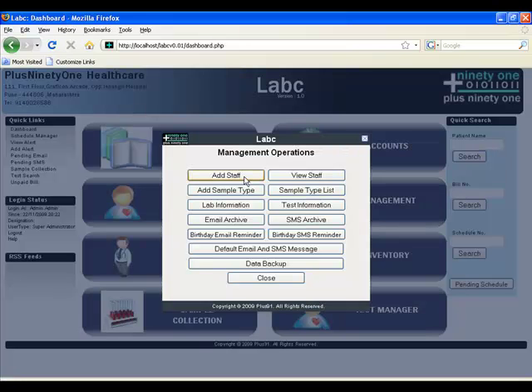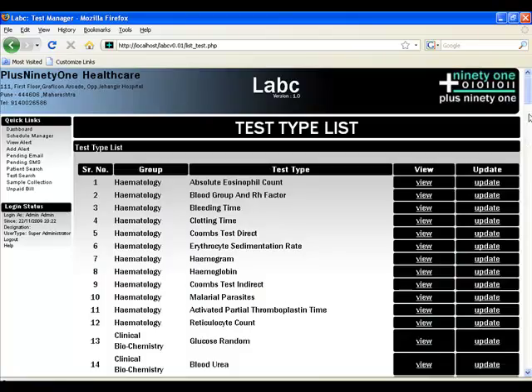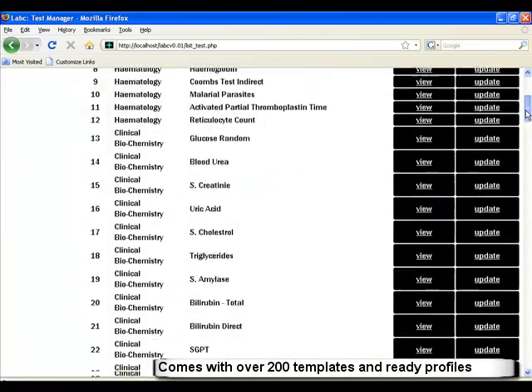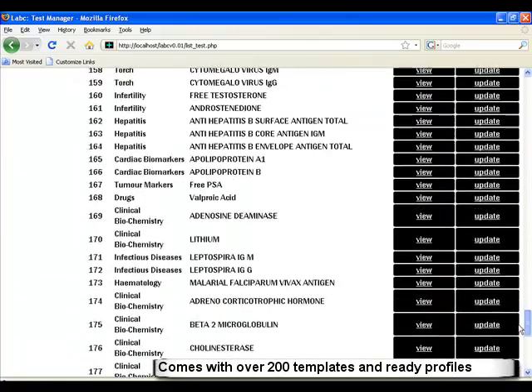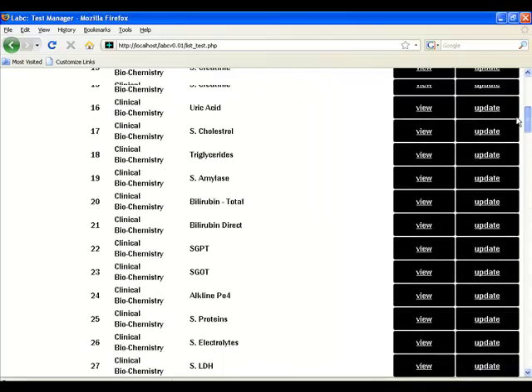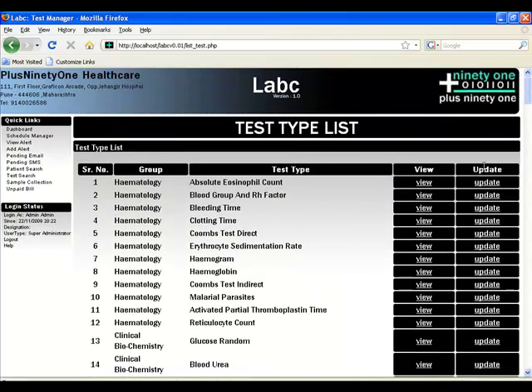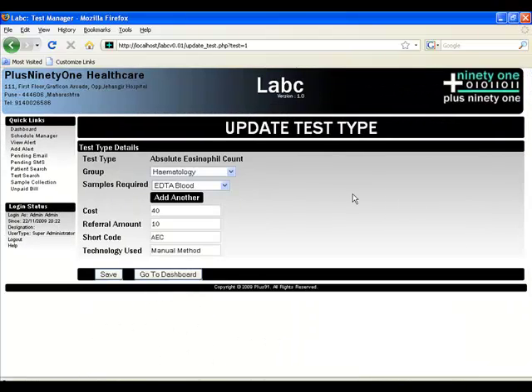Management allows you to manage the entire clinic as well as your software. You can add staff, add different sample types, and see all the different tests. As mentioned before, there are 200 templates and ready-made profiles. You can update certain aspects of the tests, including the rates and values.